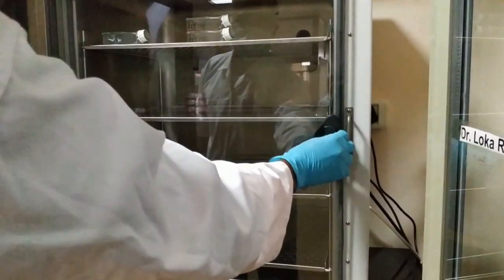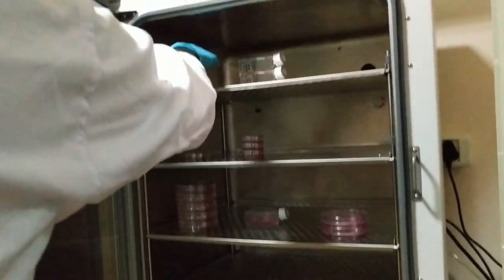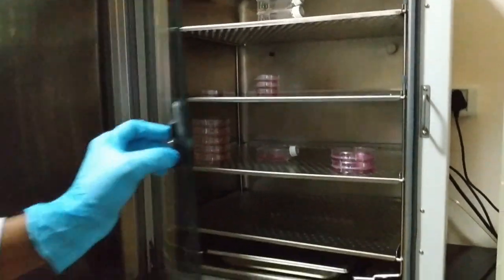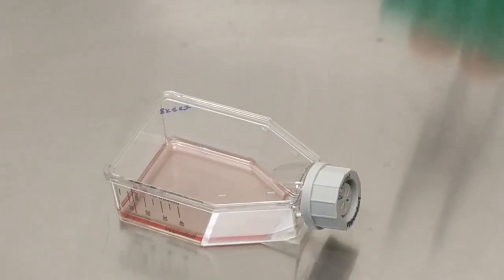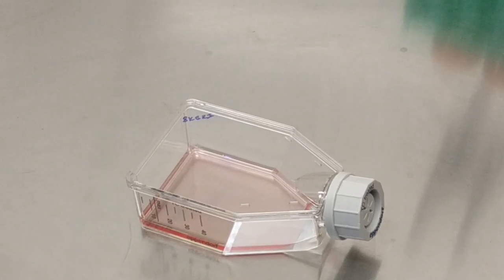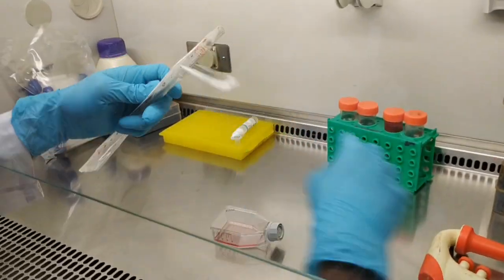Hello viewers, in this video we are going to explain how to subculture mammalian cells. These cells can be grown in various culture vessels like T25, 100 mm or 60 mm.